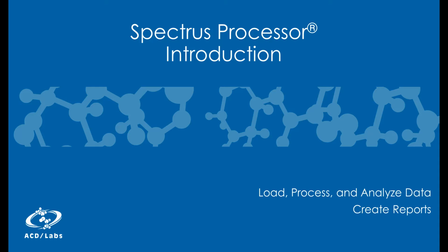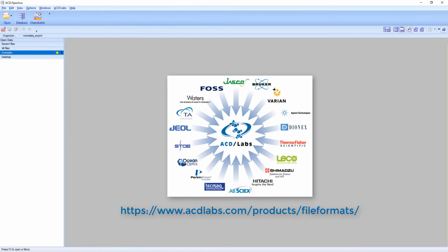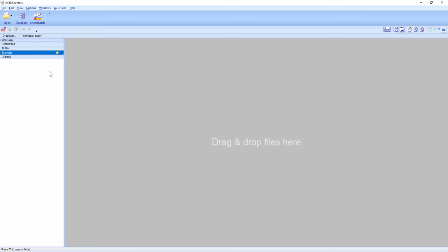This movie will provide you with an introduction to the Spectrus Processor platform and some of the basic data processing capabilities it provides. This interface allows you to import data from a variety of vendors in different formats, process data using simple or advanced tools, and then report results.